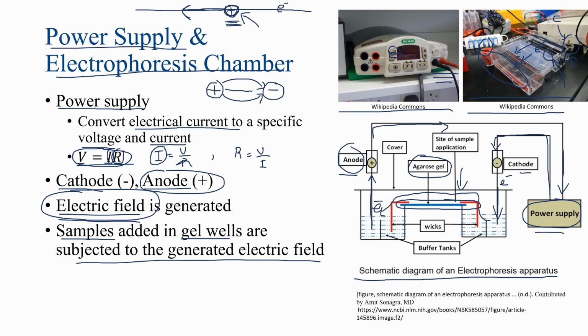So this right here would be the electrical field, and obviously electrical fields are a little bit more complicated. They'll move like this and like this. But the idea is that the directionality of the arrow is depicted as if you have a positively charged particle that is moving in the electrical field. I say this to you because it might be confusing looking at figures where you are taking into account the direction of an electrical field across a gel electrophoresis.